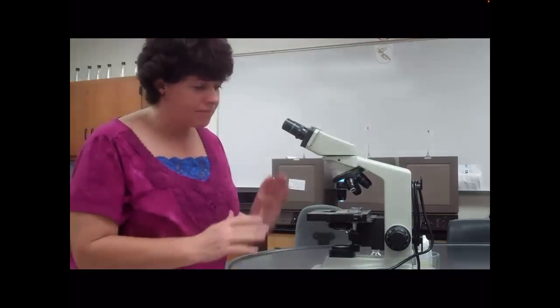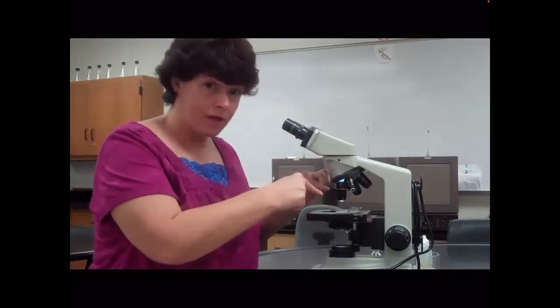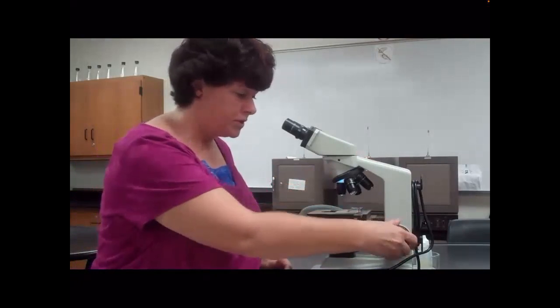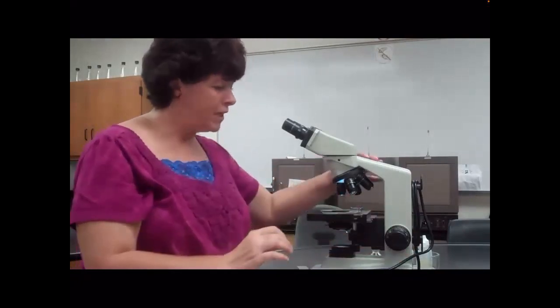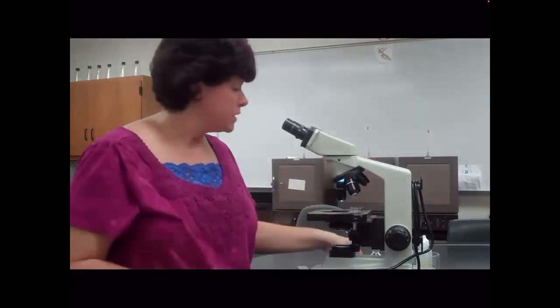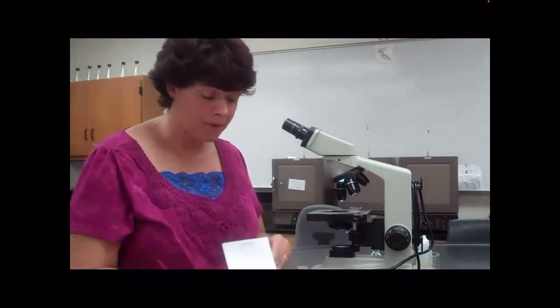So now I'm done, I found my specimens, I've done my drawing, I'm done with the slide, okay? So remember it was way up there on the 100. You're going to go to a lower power, lower the stage, remove your slide. Now, we need to get the oil off of the 100 lens. To get the oil off the 100 lens, you use lens paper. Don't use any other kind of paper. Don't use a paper towel. Don't use a chem wipe. It must be lens paper.